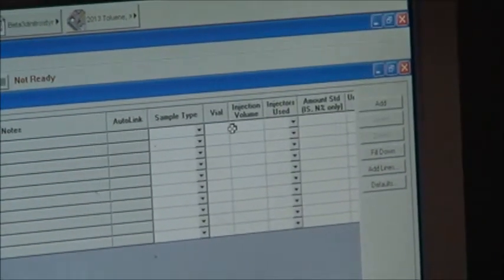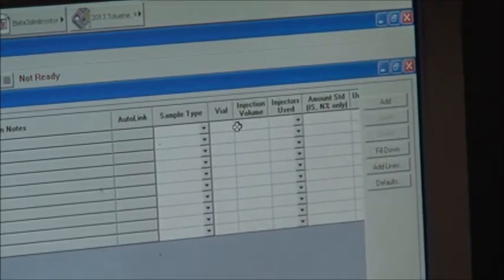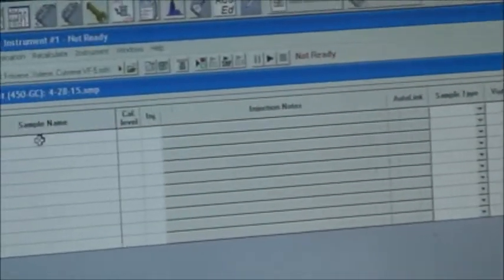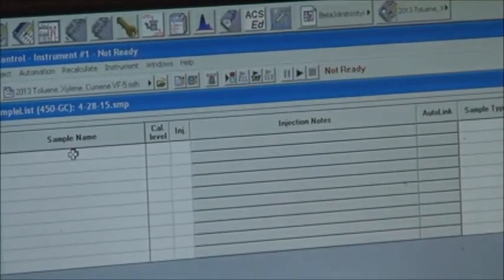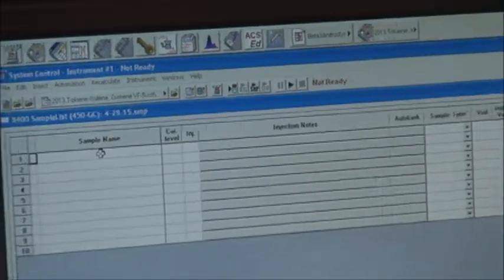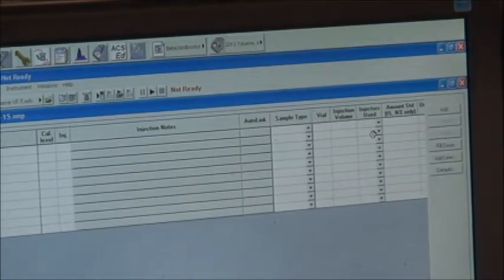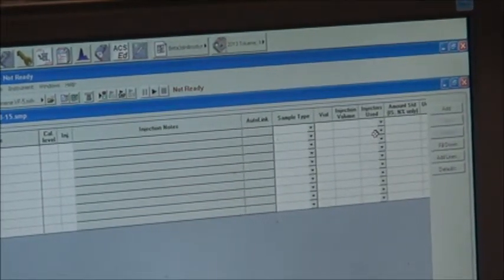and also a section for your file number, which is critical because you don't want to mix up your files. The number on your corresponding sample name should correspond to the sample used based on the sample numbers on the GCMS. You can also keep track of the amount of sample you used and the volume of the sample.